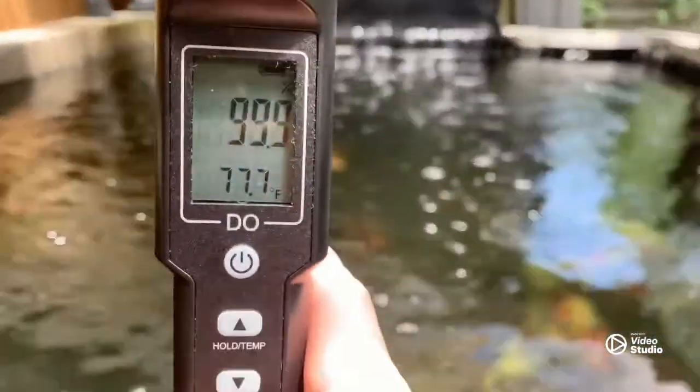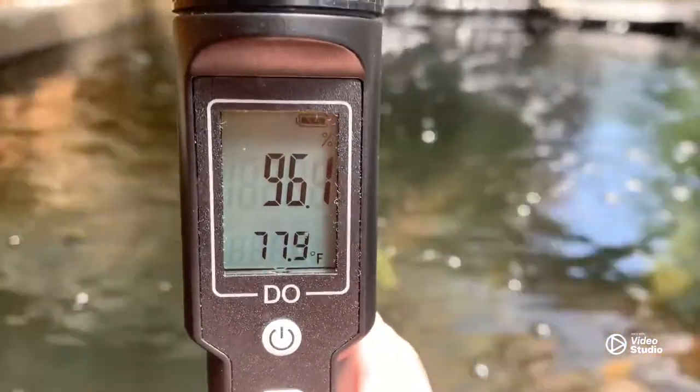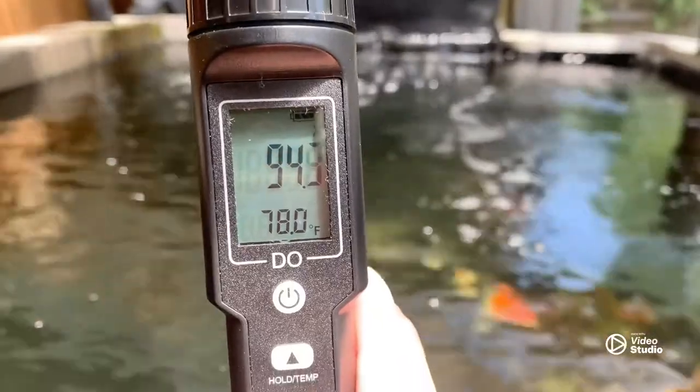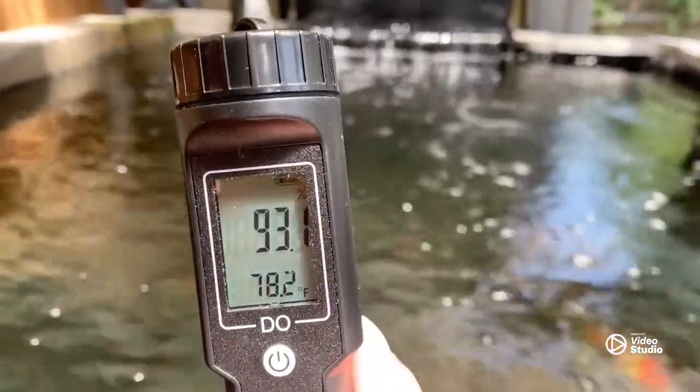All right guys, we're off to the pond. The cap is on, the electrolyte solution is still in there. You want to make sure the water level goes past that temperature sensor, so drop it in quite a ways — you can go all the way up to the cap. It's starting to change, and the temperature sensor also has to catch up to the actual water temp. We're sitting at about 82 degrees.